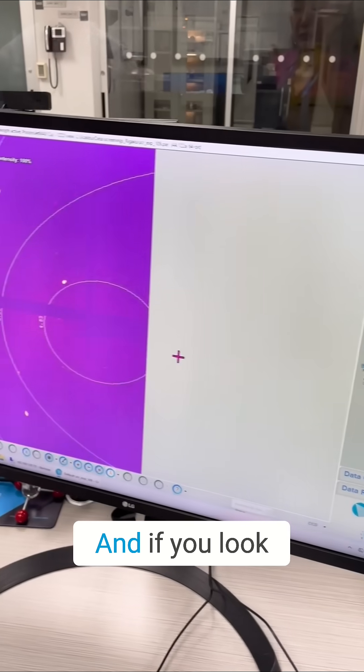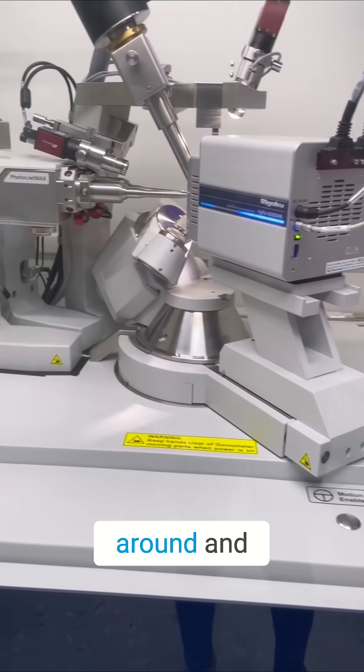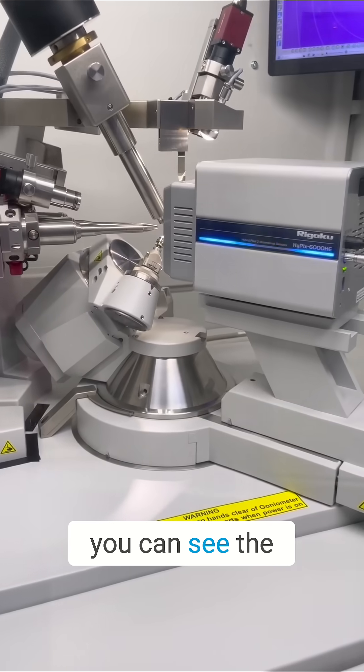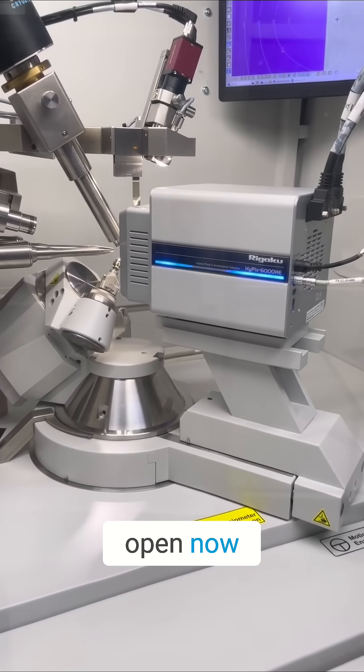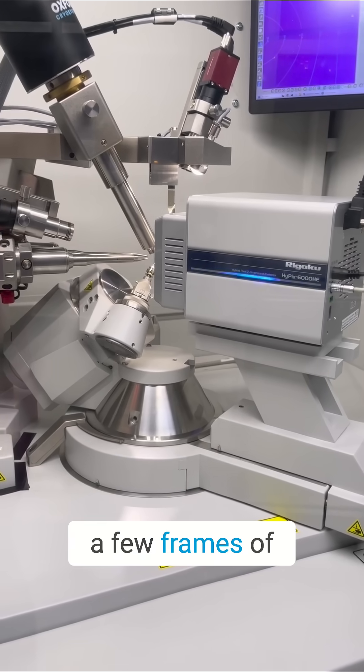And if you look back at the instrument, you see it's going to move the detector around and you can see, well, the shutter's open now and it's going to collect a few frames of data.